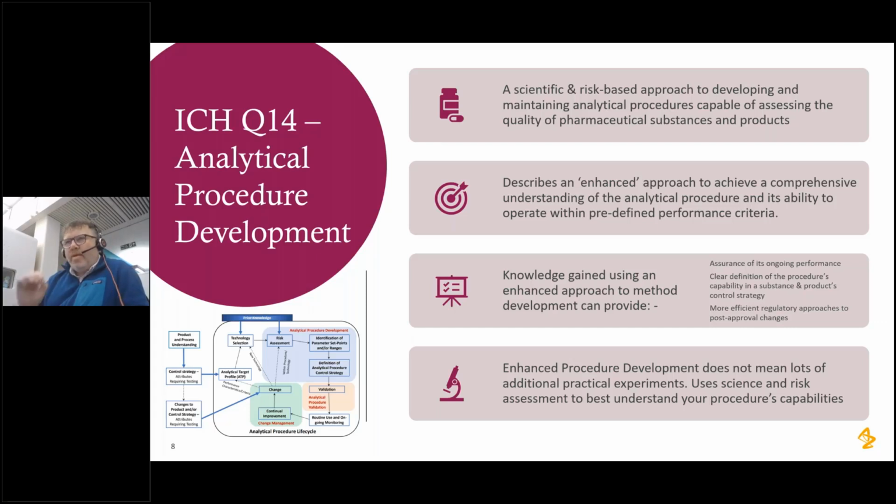And actually, if you were able to understand that method in great detail through a series of enhanced development approaches, where you really get into the nitty-gritty and understand the relationships between the different parameters on the method that you're developing, you may start to be able to have a more simplistic ride from a regulatory perspective if you want to make changes in the future when your method becomes commercialized.